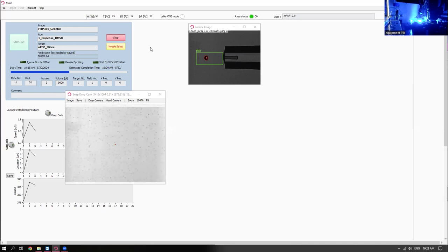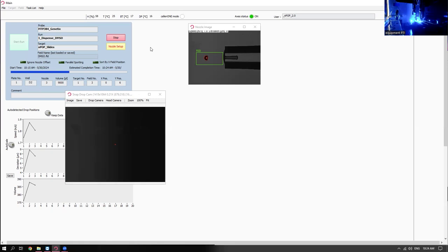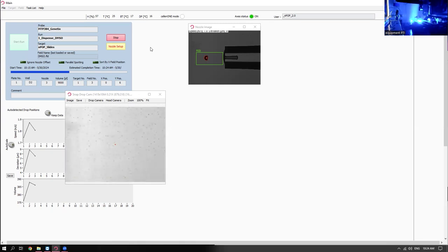And then clumping is a challenge for various cell types. I think that not letting them sit is a big key to that. We do have some resuspension protocols that the nozzle can do automatically, and we have customers in the cloning space where they have 100 different edited cell lines they want to run in a day, so the instrument can do this resuspension on its own. It's just whether or not you really need that in your process. Most people just pipette their cells up and down right before they aspirate.